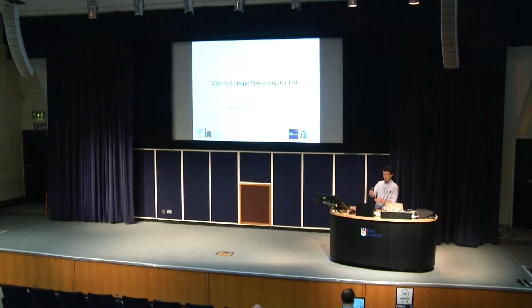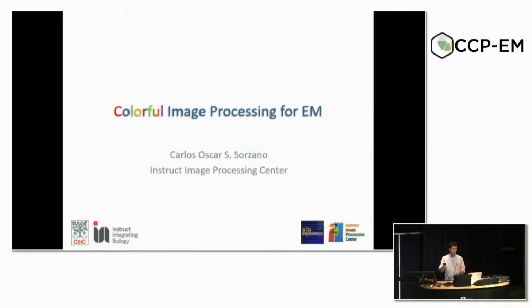And if there is no problem, at the end of your acquisition you have the early stages of the processing, currently up to 2D classes, already available. So you can go home with the project. The other one is once you have finished your processing, you could deposit at the EMDB. At the moment, it is not fully ready, but we are working towards that. The whole workflow that you have done, so that things are repeatable, and people can understand exactly the image processing you have done. So what I will explain today is after acquiring.